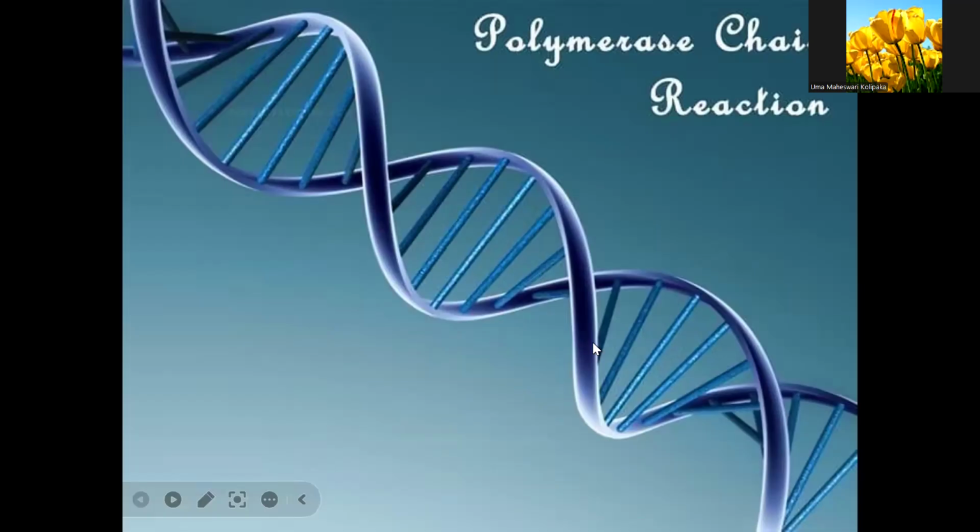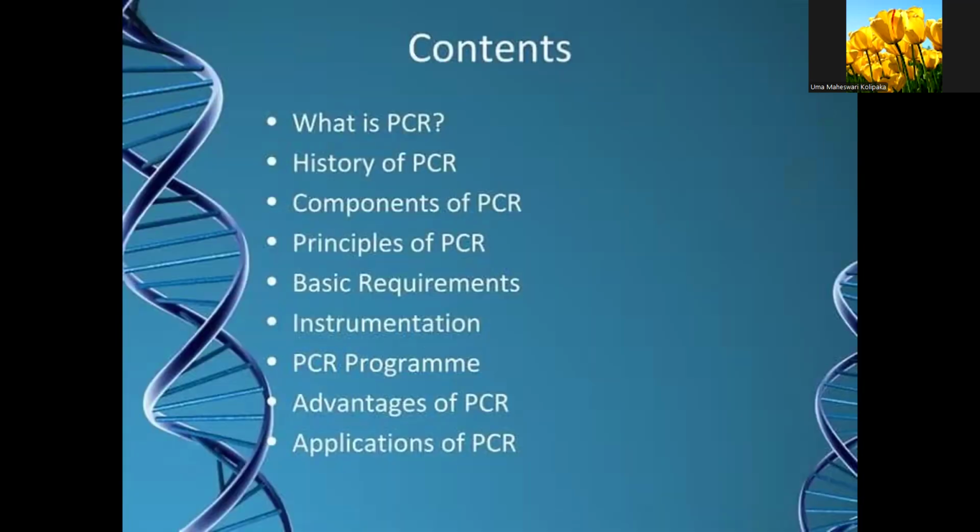So, first coming to contents, what is PCR? Today, we are going to discuss all these topics related to PCR. First of all, what is PCR? History of PCR, components of PCR, principles of PCR, basic requirements, instrumentation, PCR program, advantages and applications of PCR.